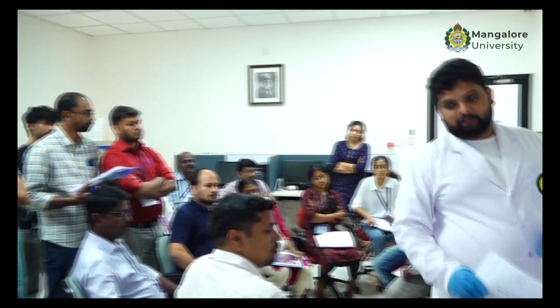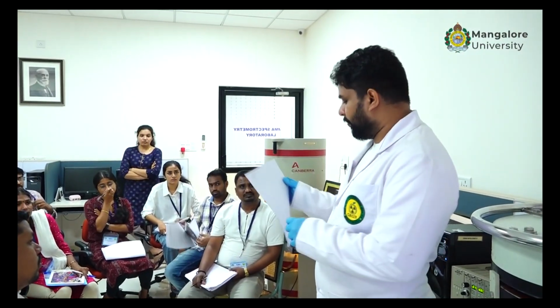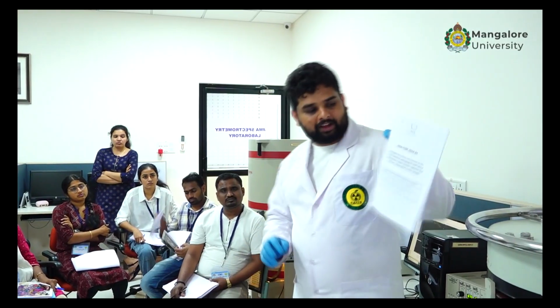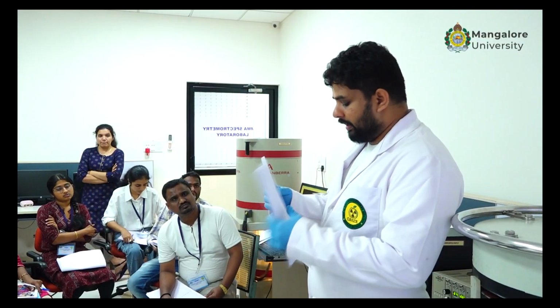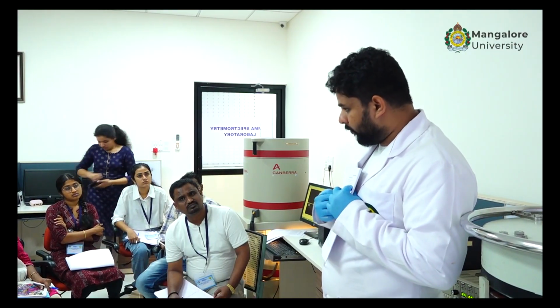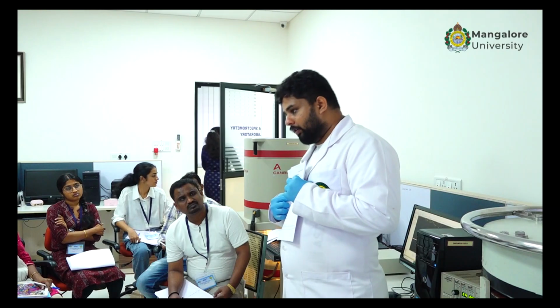During an intercomparison exercise, we get an email or a printed copy, priorly we used to get a printed copy, of a sheet like this which says IAEA TRC 2024 1 Worldwide Proficiency Test Exercise, Determination of Anthropogenic and Natural Radionuclides. This year, on the first page you will get the description of samples. You can see there is a spiked water, sample 1 and 2, where sample 2 is a quality control sample.